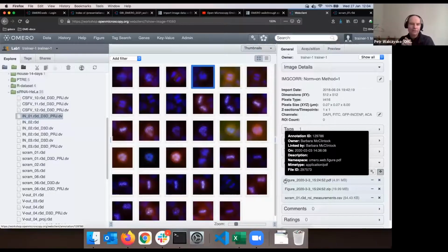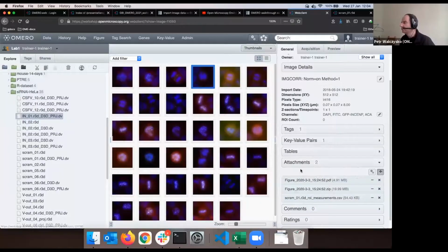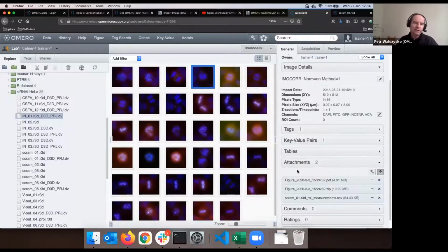Or Fiji, we can talk about a macro in Fiji. Let's say you pop it on your dataset and then tell Fiji via a script, okay, the macro is there, download it via API, use it, insert it into the script, execute it on the whole dataset, stuff like that. Okay. Furthermore, OMERO will do something nice if the file is PDF, CSV, or a text file.